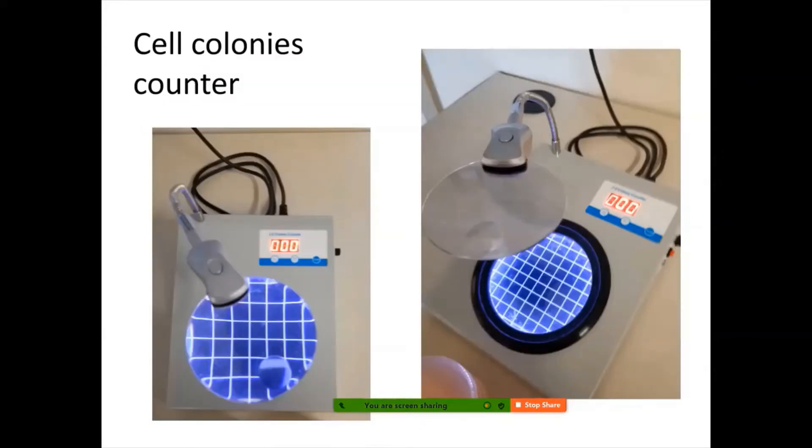A piece of equipment you need to know is the colony counter. In the past we used to have a pen to attach to it, but unfortunately we've lost that pen. Nevertheless, this machine is very useful for us to see the plate much more clearly. There's white light in the background to help students see the colony or inhibition zone more clearly, and there's a magnifying glass on top as well. There's also a counter so you can press up or down to record the number of colonies you're counting.